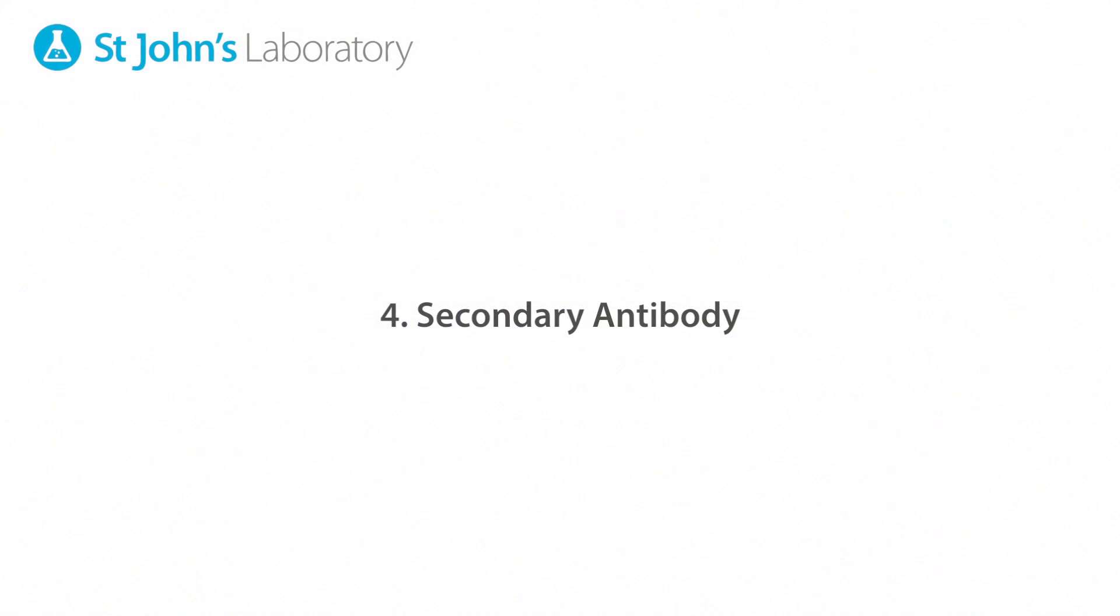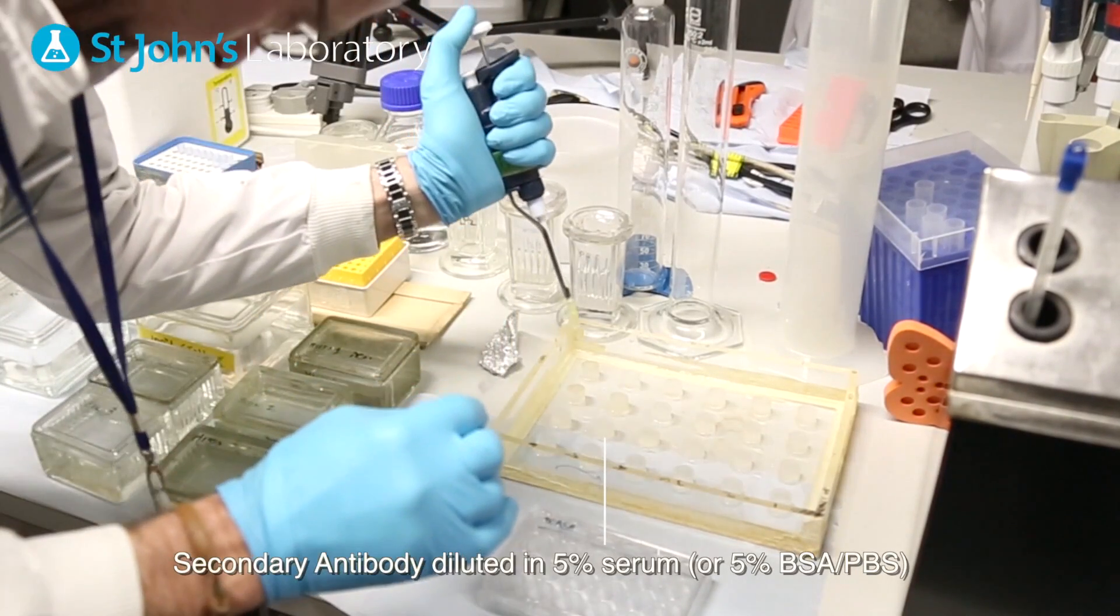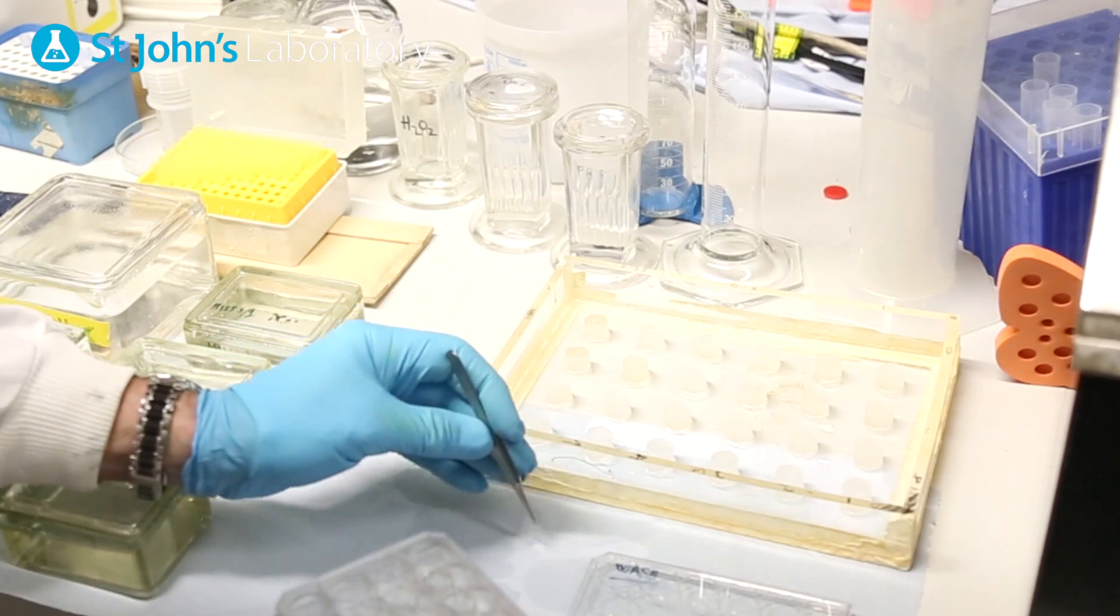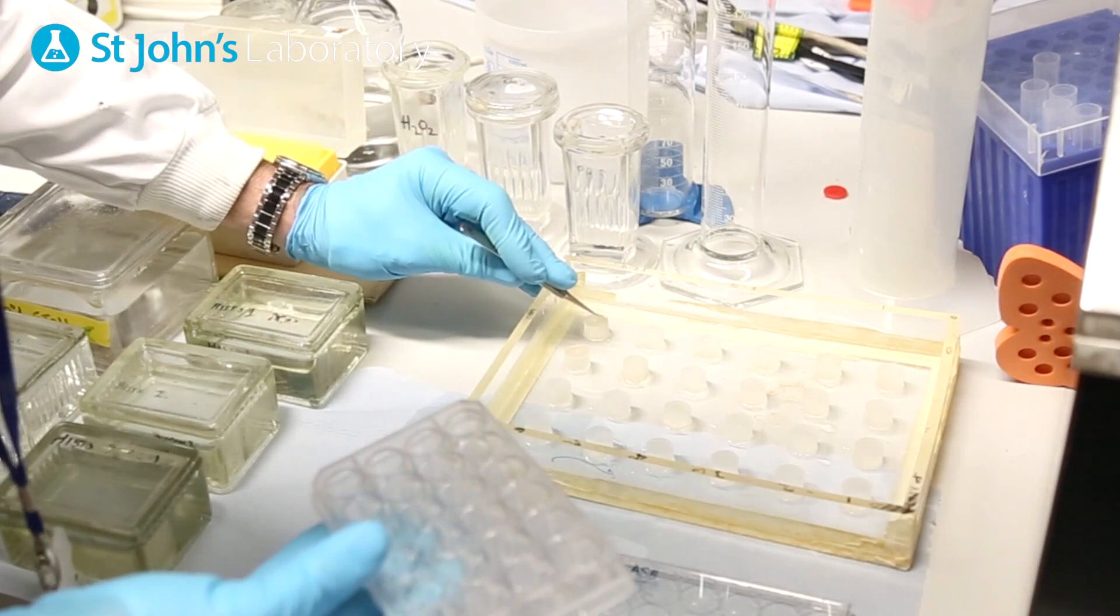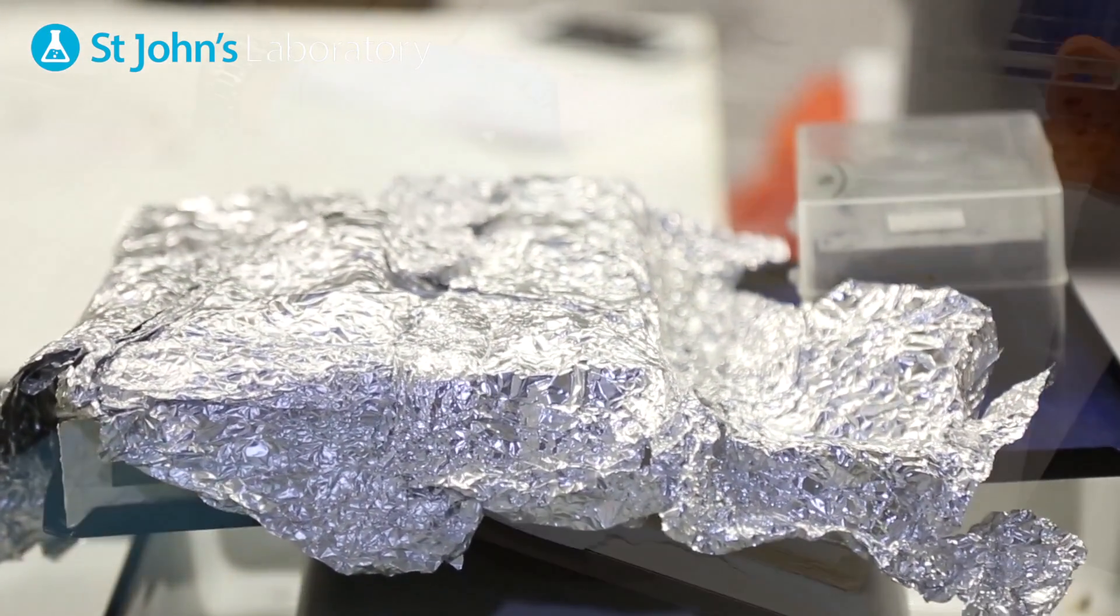Carry out your secondary antibody application in a similar manner to that of your primary. Ensure that your secondary antibody is conjugated with an appropriate fluorophore for visualizing the protein of interest. Incubate this for 1 hour under foil to prevent bleaching the fluorophores.